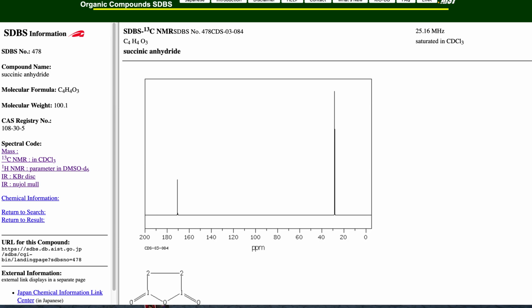What you do first, hopefully, is you listen to the lecture tape. PowerPoint slides will be there, infrared, and then go to the SDBS, and I'll probably give you a couple of assignments where I'll have you obtain infrareds and try to identify 2 or 3 of the signals showing up.